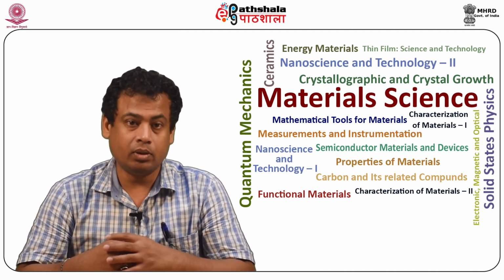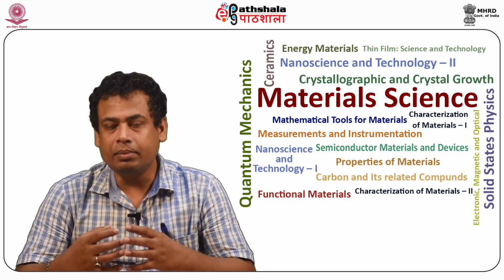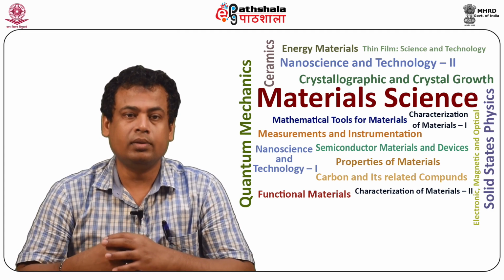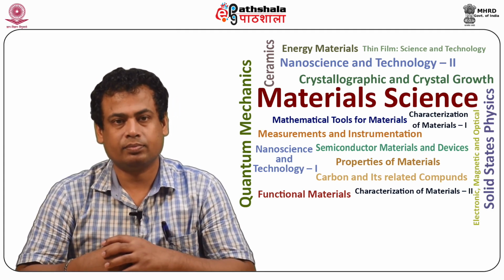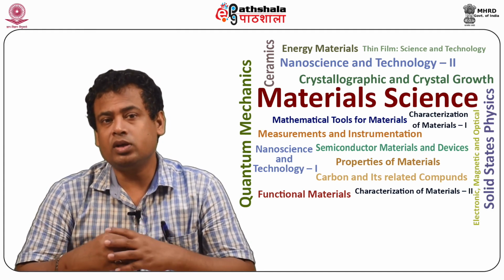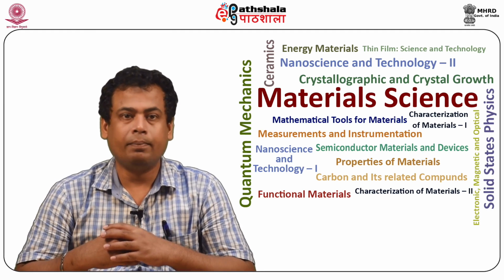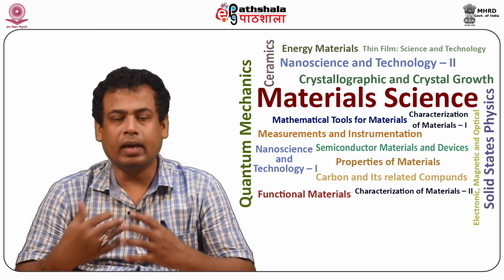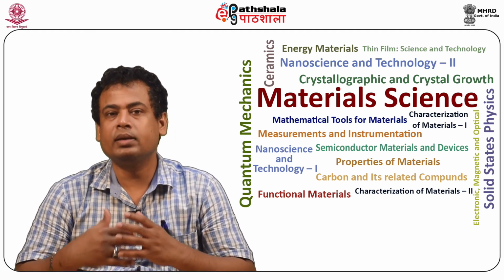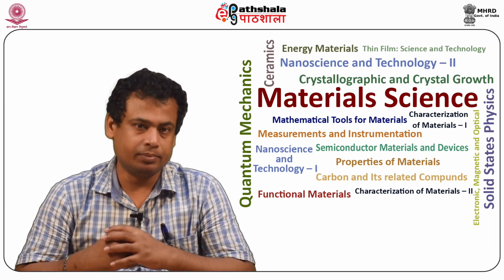This helps to keep the tip clean, reducing noise and instability even in degraded vacuum conditions. The SFE guns are similar to other FE sources but include a suppressor grid to eliminate the unwanted thermionic emission from the region outside the tip.